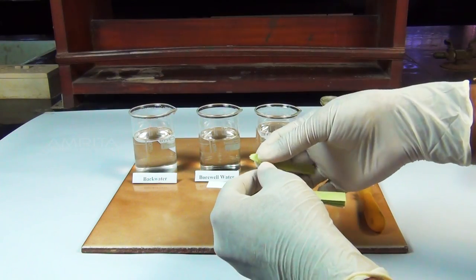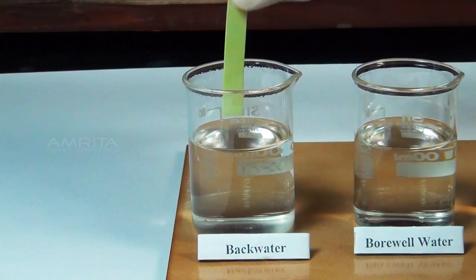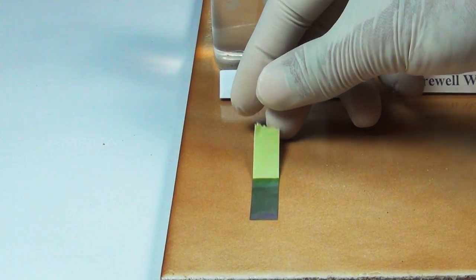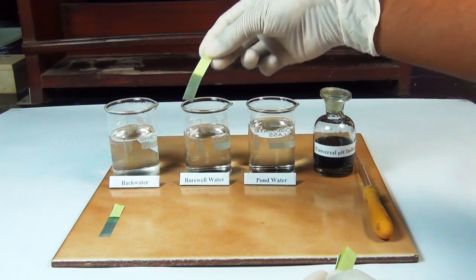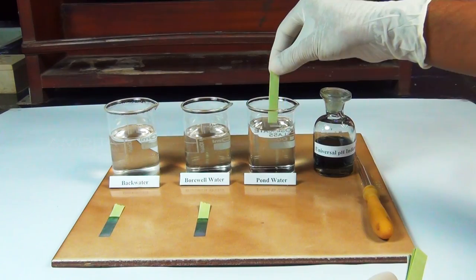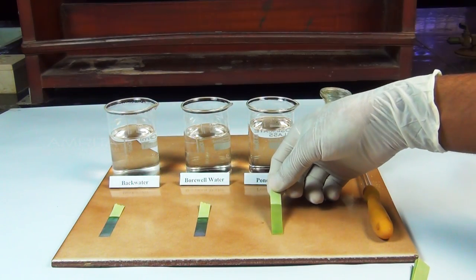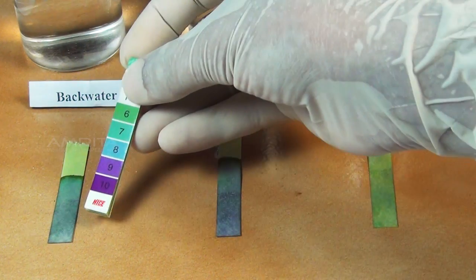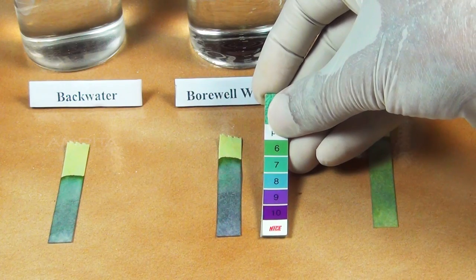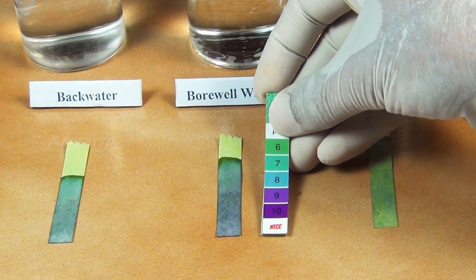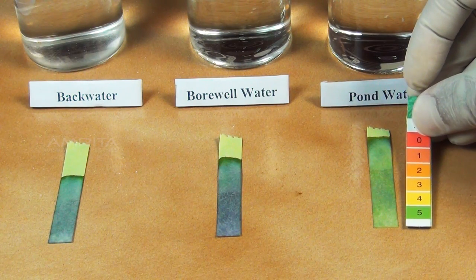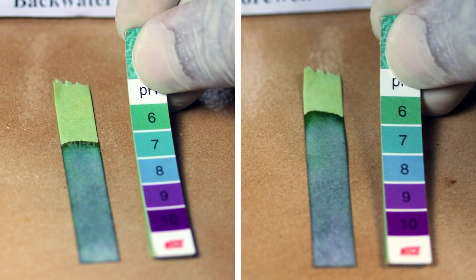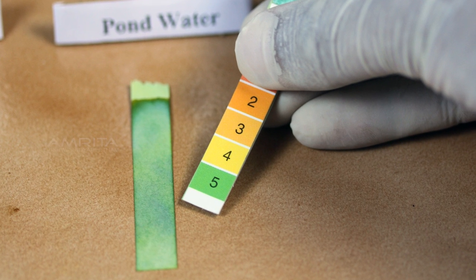Take a pH paper strip and dip into the beaker that contains back water. Keep the wet pH paper strip on the tile. Do the same procedure for borewell water and pond water. Wait for some time to dry the pH paper. Note the color and compare with the color chart given on the broad range indicator paper and get a rough estimate of pH of the sample solution. We can observe that back water and borewell water has pH 8 and pond water has pH 5.